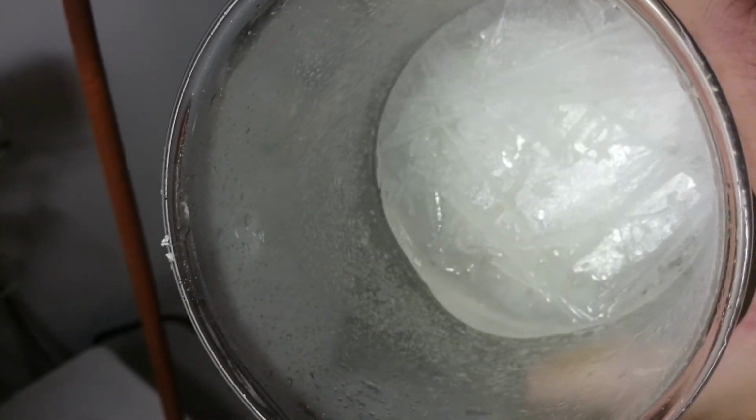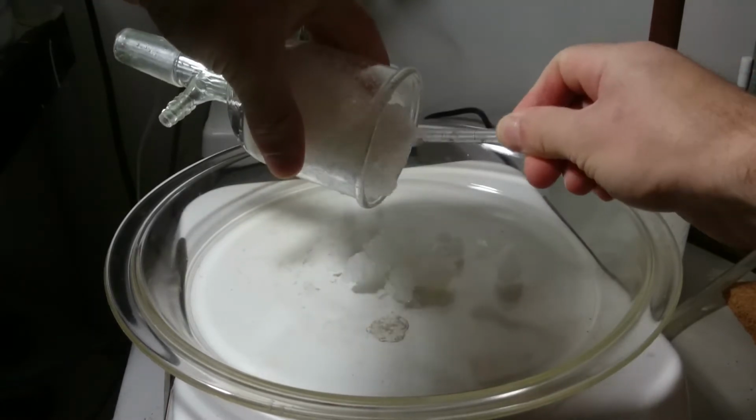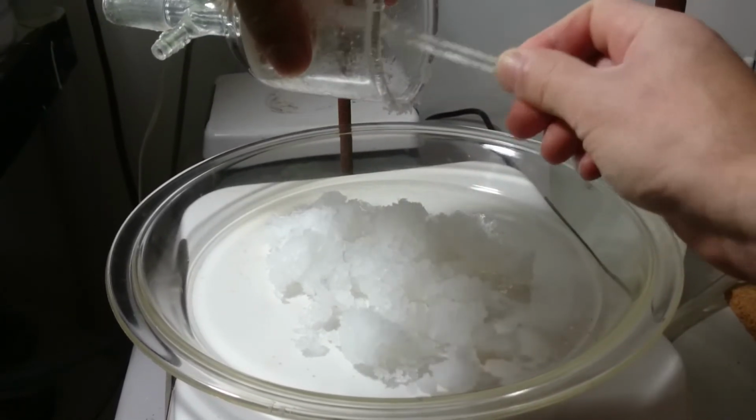It's also possible to dilute the solution with another solvent in which sodium propionate is not soluble. In this case you could use acetone, but I think that's fairly wasteful. It's easier just to boil it down.